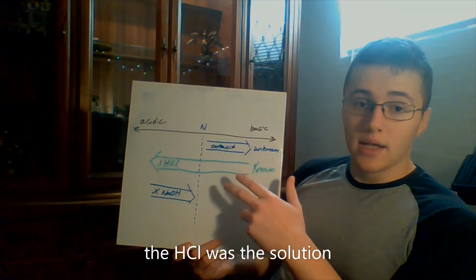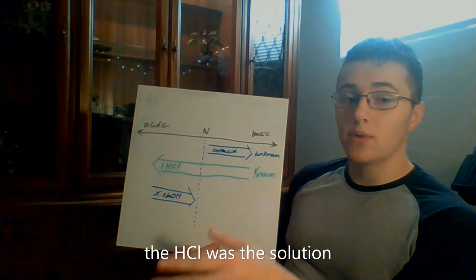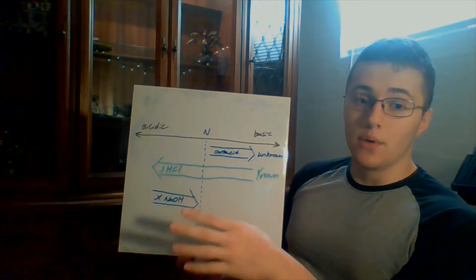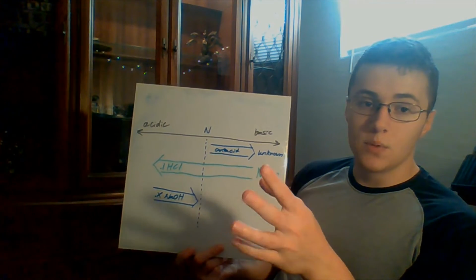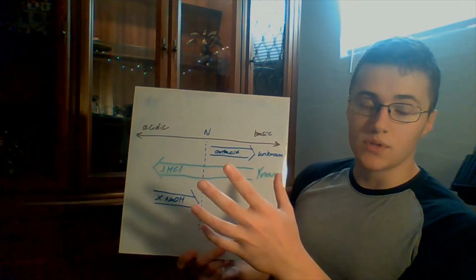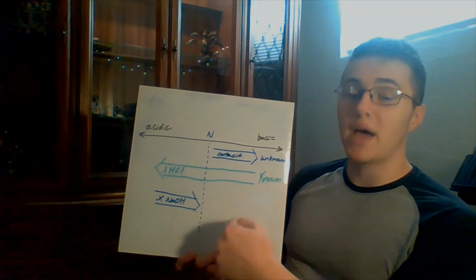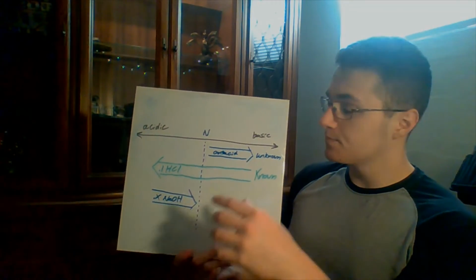So when we add our antacid, we have a certain mass, it's stuck in there. That is our unknown. We don't know how much calcium carbonate is in there, the base that we're tracking. And when we add this HCl, that is one known value that we have. I'm sure you could probably figure out a way to do all this if you knew what the ratio of calcium carbonate in this whole solution was, but for practical purposes, and because we don't always get 100% yield, we're going to do a back titration to track the actual amount that is in the solution.